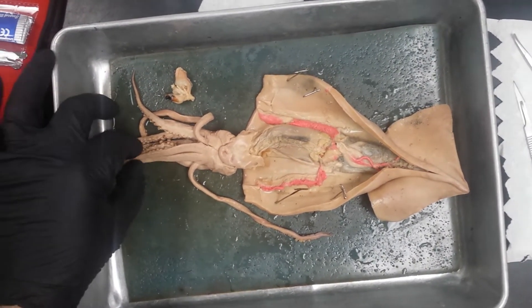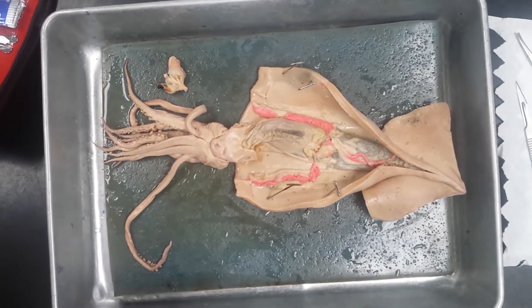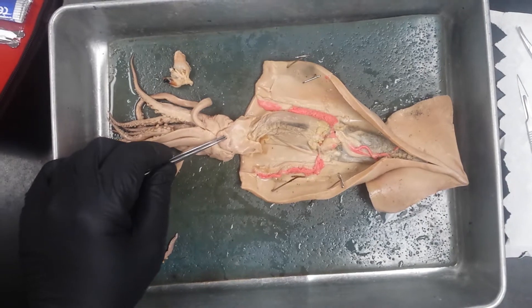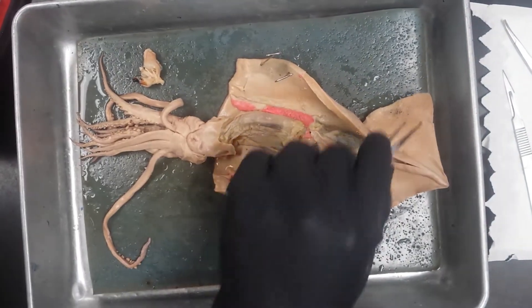We'll start off with the most obvious things. These are the arms, and there's the tentacle. We have the funnel right here. This space inside is the mantle cavity, enclosed by the mantle. Here we have lateral fins.